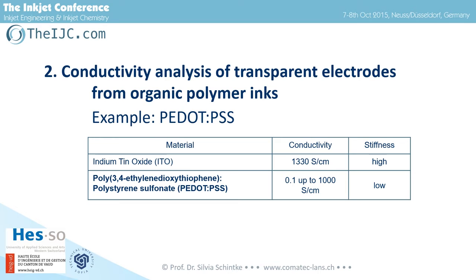However, although we can use commercial 4-point probe heads, they are not always suitable for these soft materials to measure conductivity in a reliable and reproducible way, because you come with your probe and you don't know how much you dig into your surface. And if you really apply the same force, you start damaging these soft materials easily.